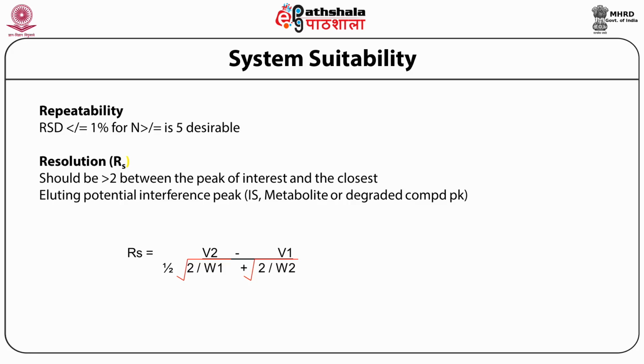So repeatability is another important parameter, that is batch to batch variation. Sometimes when you go for manual injection, the errors of relative standard deviation go up, and it should be minimized as much as possible so that you don't get much of a problem in the injection and your hands are set for that. In autosampler, it's much easier. When you are continuously injecting the same concentration and the same volume over more than 5 injections, it should give the same area with less than 1% deviation.